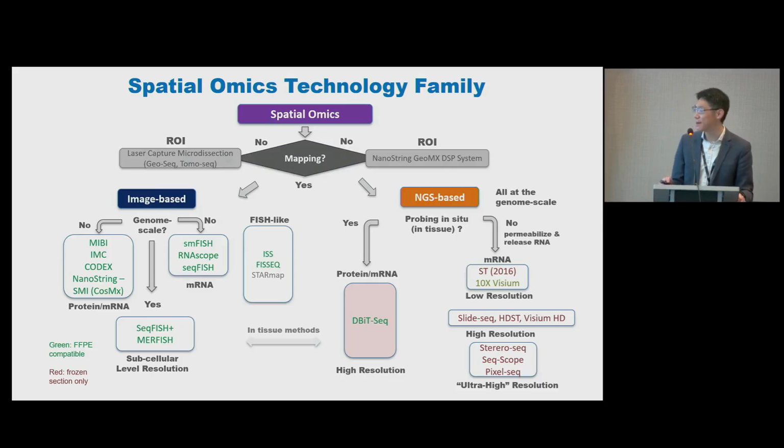But nowadays, a paper that was published just probably 2 weeks ago by Akoya Bioscience and a group of scientists in Australia demonstrated you can actually image up to 101. What I heard is 103, but eventually they were a little bit conservative. I think 2 of those were maybe not imaged over all the samples they put in that paper, so they just tried to claim only 101, but it's still stunning, right? So now you can image more than 100 proteins simultaneously from the same sample. So that's the world record.